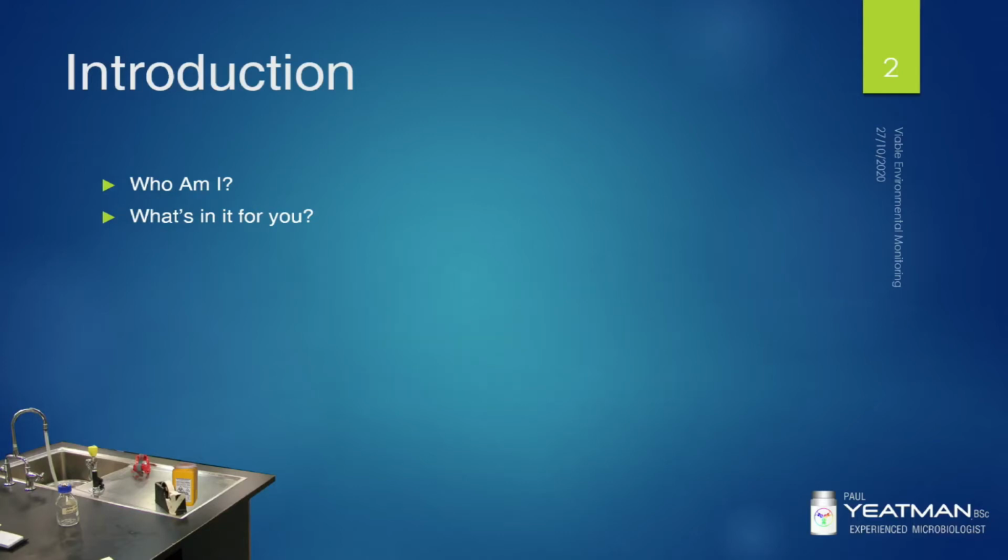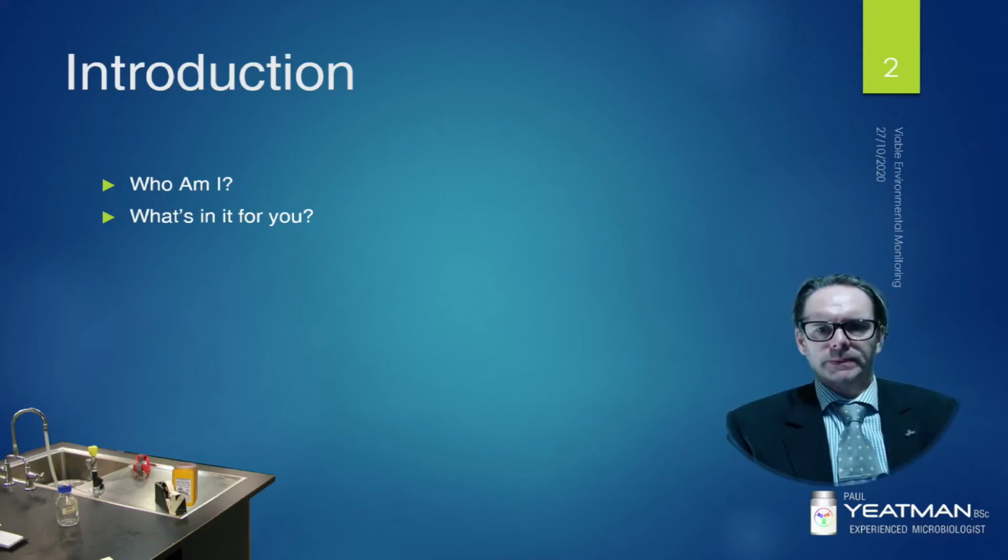So, what is in this presentation for you? Microbiologists are directly involved in the collection of viable environmental monitoring samples from production rooms, support areas, and purified water systems. Often such work is carried out without a deeper understanding of why these samples are required and how the sampling sites were chosen. So this presentation aims to provide this understanding.